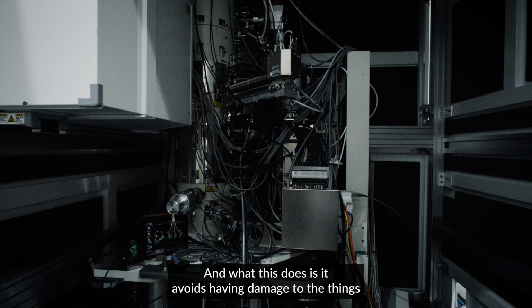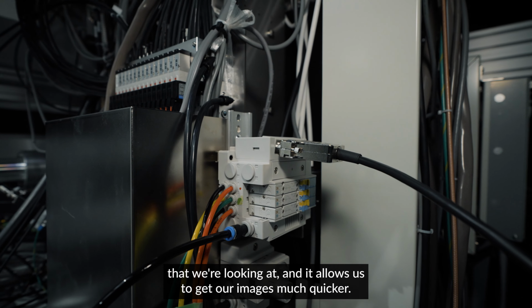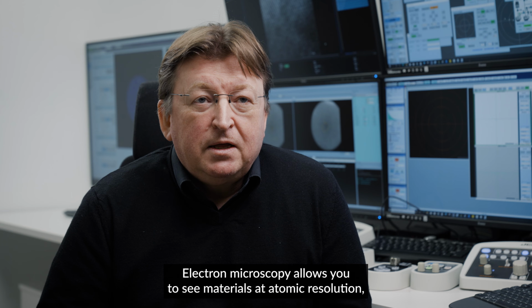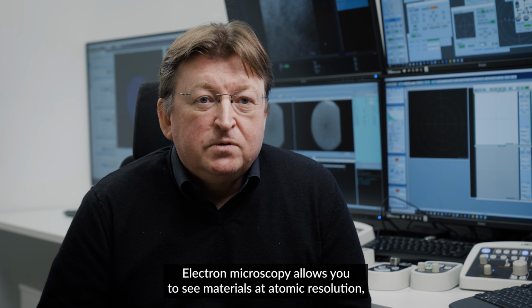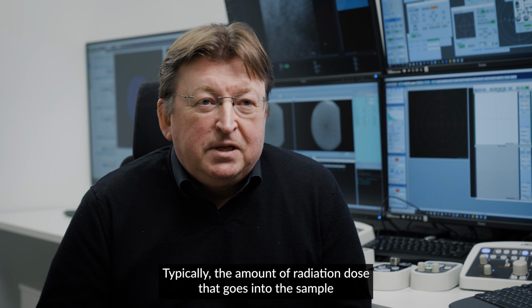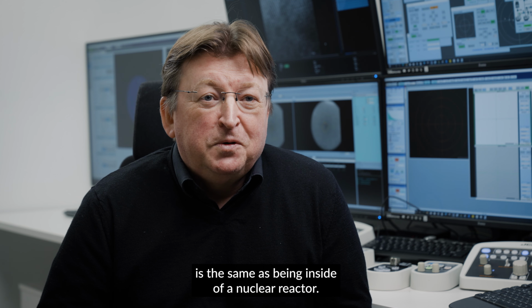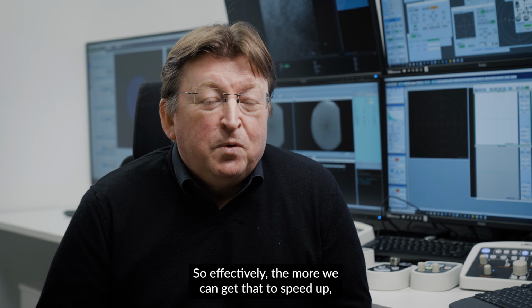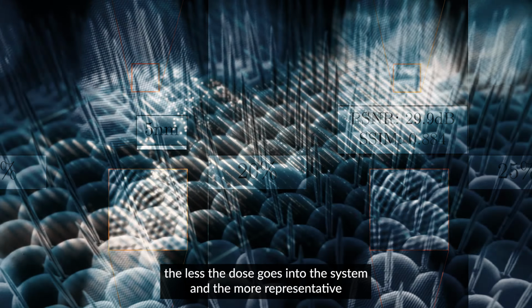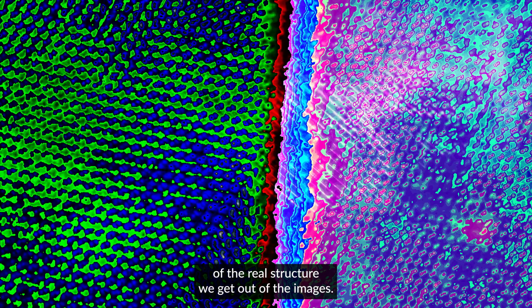And what this does is it avoids having damage to the things that we're looking at, and it allows us to get our images much quicker. Electron microscopy allows you to see materials at atomic resolution, but in doing that, you're also damaging the materials that you're looking at. Typically, the amount of radiation dose that goes into the sample is the same as being inside of a nuclear reactor. So effectively, the more we can speed that up, the less the dose goes into the system, and the more representative of the real structure we get out of the images.